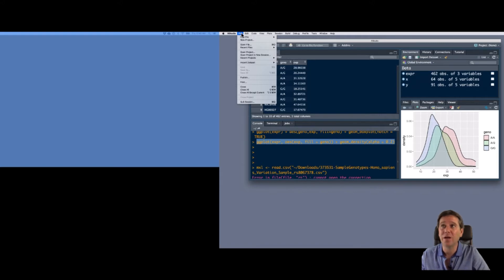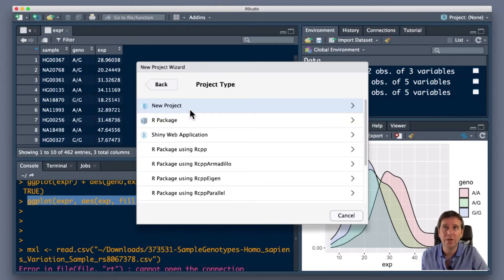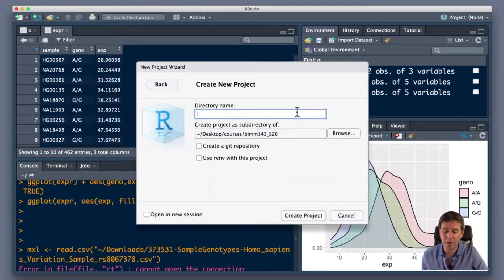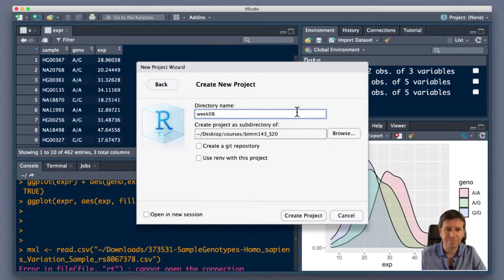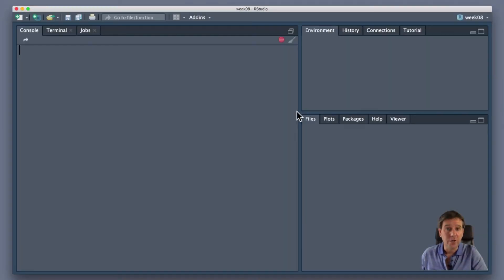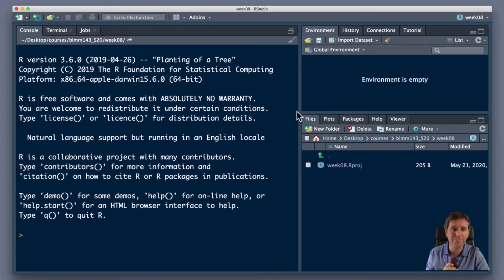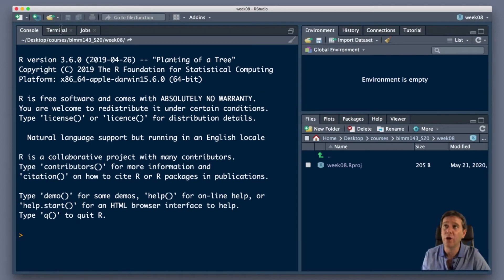To do the analysis, I'm going to go over to RStudio. I have RStudio already open, but I'm going to do File, New Project, New Directory, New Project. I'm going to call this one week08 because we're in week eight of this course. We'll get a fresh RStudio for our use today, with a fresh directory and project where we can work.